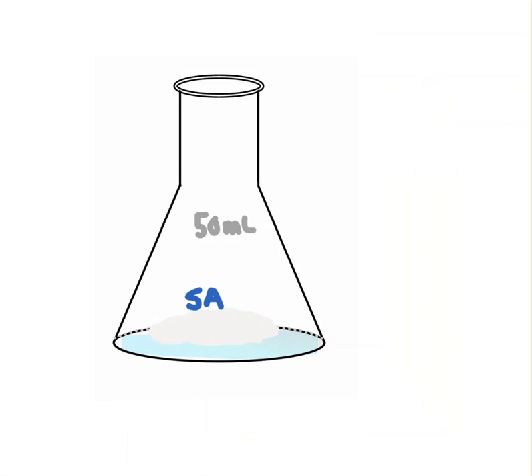Next, we're going to put our salicylic acid into our flask and we're going to weigh it again. And so the mass of the flask with the salicylic acid only is your data that we have labeled C. So after we weigh that, we can subtract and get our true mass of the salicylic acid that is in our reaction flask. We're going to add a few more things.